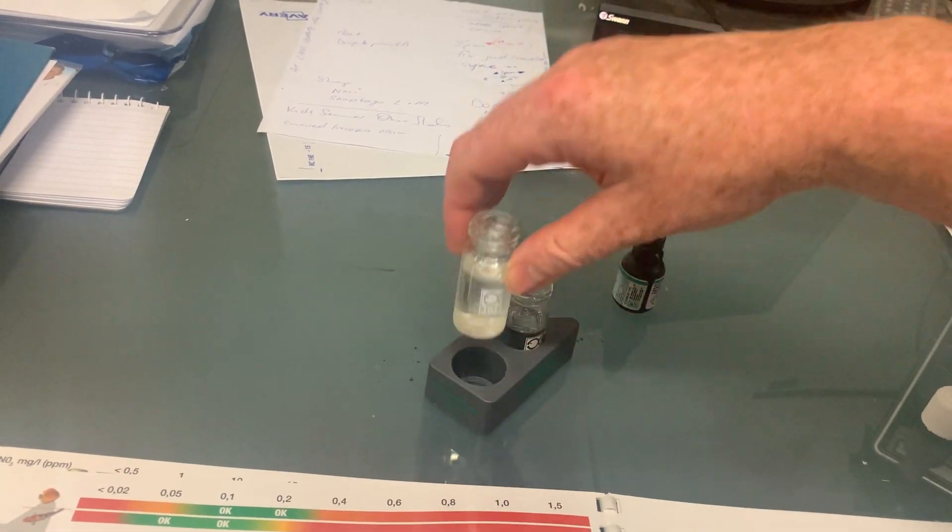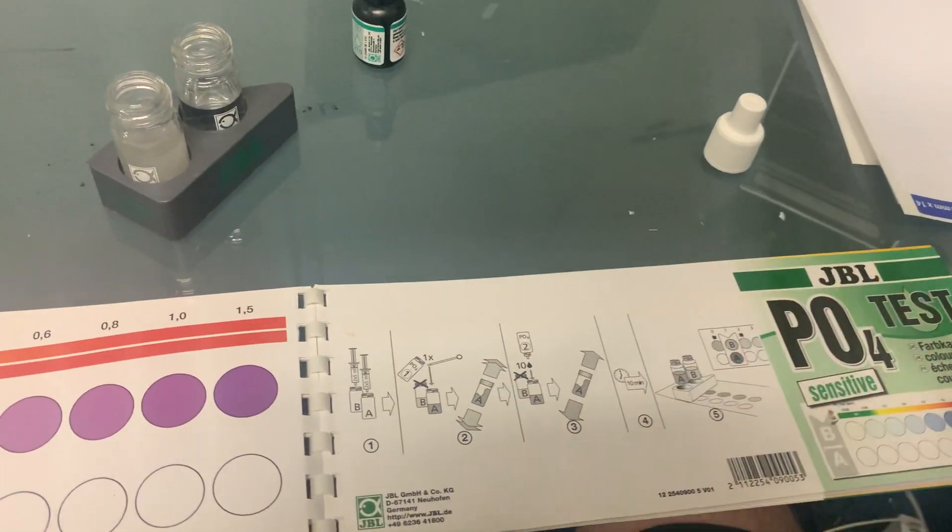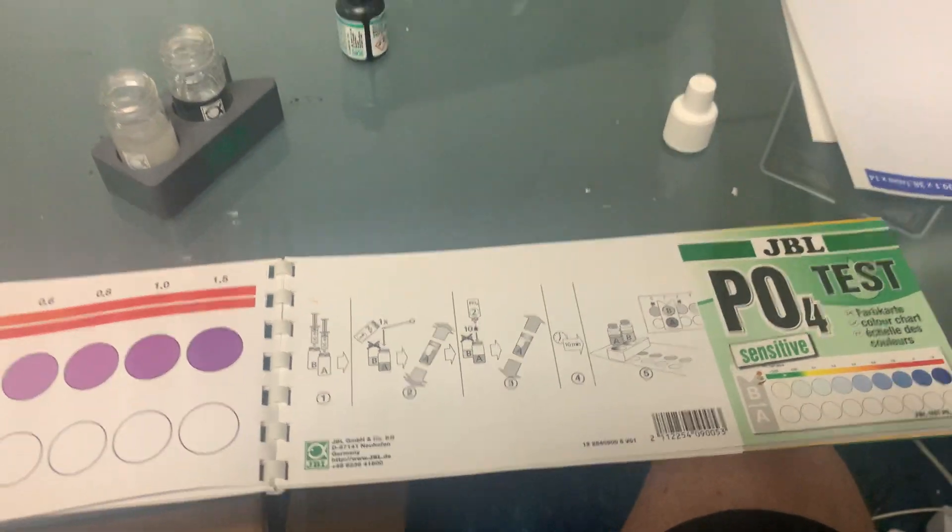Now I'm going to give this a little shake to make sure everything is dissolved and mixed in well. This now has to wait 10 minutes, so I'm definitely not going to wait 10 minutes on camera.